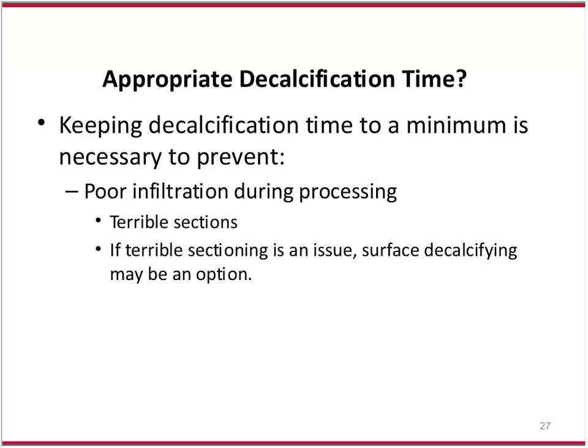I don't have an approximate time to tell you, but you're going to have to pay close attention to your samples in your lab by yourself and figure that out. But we'll put a sample on ammonium hydroxide for maybe 30 seconds is where we would start. And then you have to rinse this sample off with water and then go ahead and cut it.